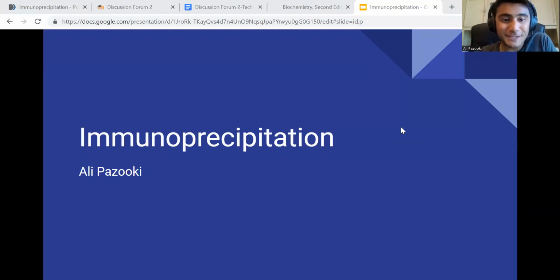Okay, hello everyone. This is my presentation regarding immunoprecipitation, which is a protein isolation technique. Let's get started.